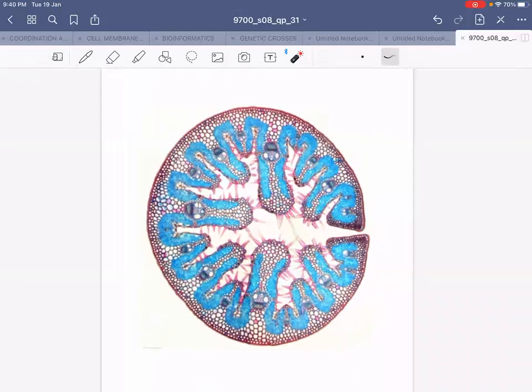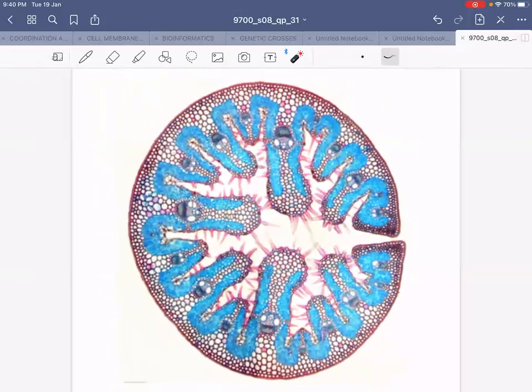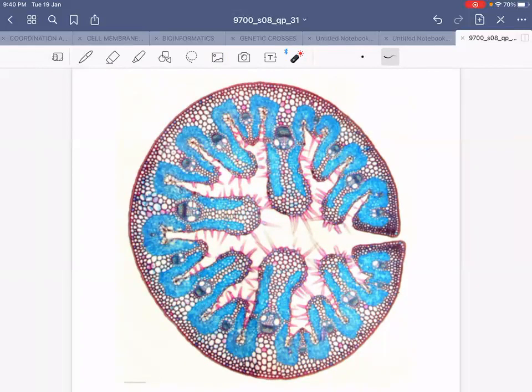You can see some very typical features of a xerophyte: it has a very thick cuticle to prevent excessive loss of water by evaporation. You can see trichomes, which are hairs whose primary role is to trap a layer of moist air so as to reduce the diffusion gradient for transpiration. There are also sunken stomata, so lots of features suited to a plant that grows in a region where water is scarce.